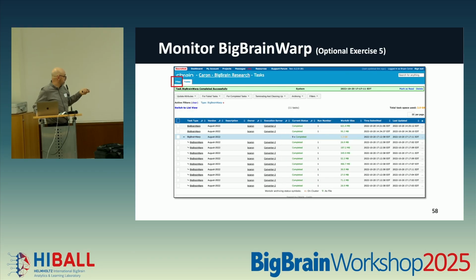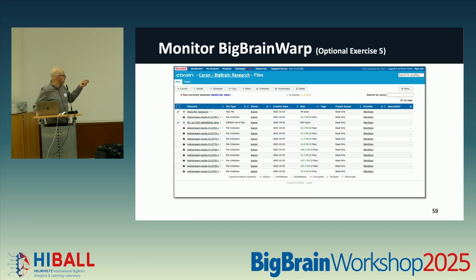You see them all completed. And then you have the individual collection. So these are the process outputs that you would see. So instead of doing it 9 separate times, you get 9 separate output boxes here. Again, apologies for this not working at the moment. I think it's related specifically to the fact that we have specific accounts that we created for the workshop here. But like I said, when I ran it here, with individual outputs, I can navigate directly into each of those outputs for those 9 files.